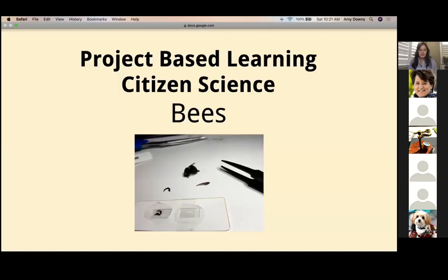So moving on to the next idea with project-based learning, there's a lot going on in the world with bees. I was lucky enough when I was putting this together this week, it's just kind of crazy how your eyes start to see things that maybe you wouldn't have seen before. I had a little bumblebee that had passed away in my driveway, so I collected him up and saved him to use with the Foldscope, and to share the idea of using, if you find a bee that's dead, or you can also use pre-made prepared slides as well.